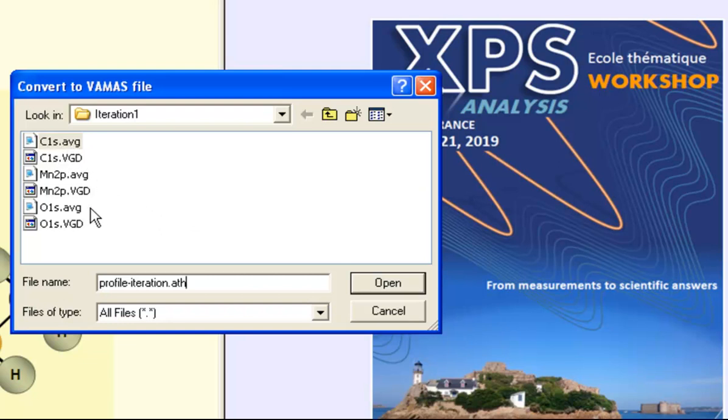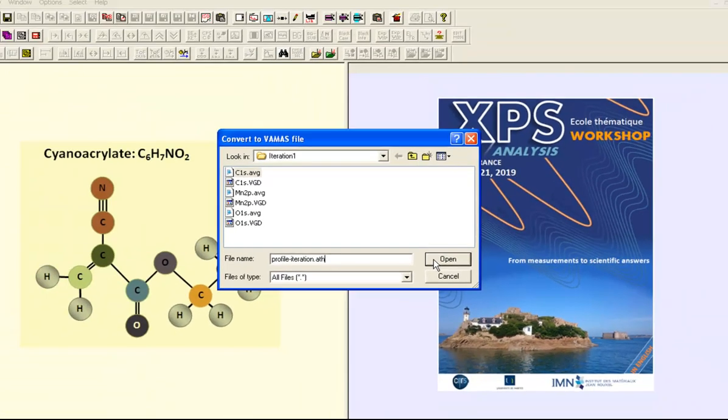So we have three different AVG files and these will all be read when we press the open button and the new VAMAS file written back to this directory.